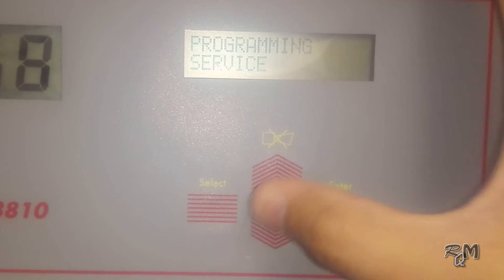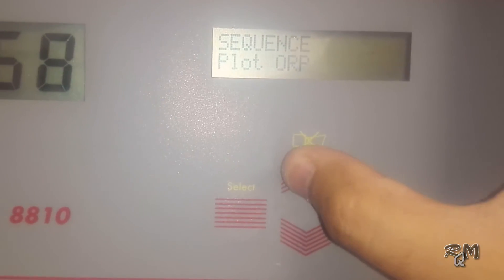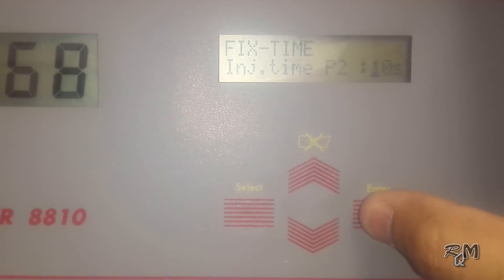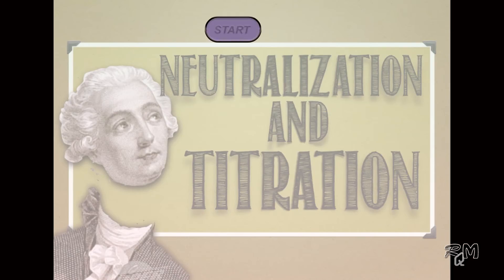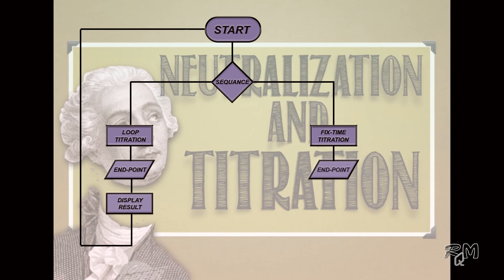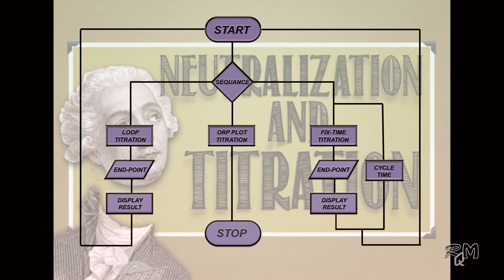After the cleaning menu comes the service menu, which has already been discussed in detail. Next is the sequence menu, which has 3 options: Loop, Plot ORP, and Fix Time. Loop and Fix Time are related to the normal operational sequence of the analyzer. In Loop mode, after finishing the first titration the analyzer will immediately start the next titration. In Fix Time mode, the analyzer performs titration as per the cycle time set in the timing menu — currently 15 minutes. Plot ORP mode uses the electrode to plot an ORP graph to get the endpoint for titration and to verify electrode health.